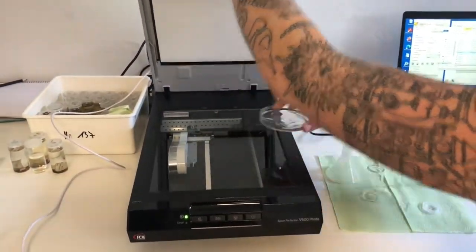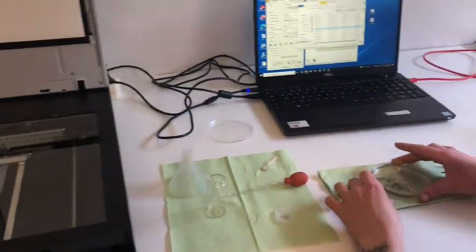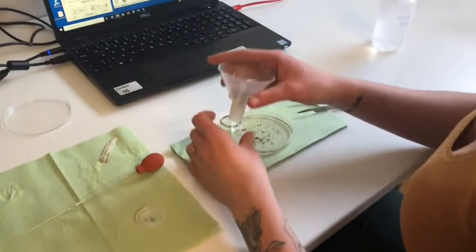After the scanning is over, we transfer all animals back to the vial by flushing them from the petri dish.